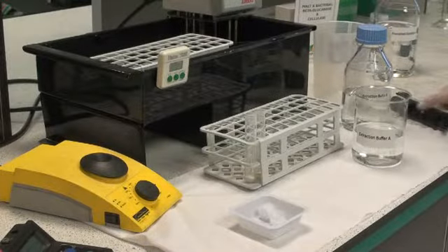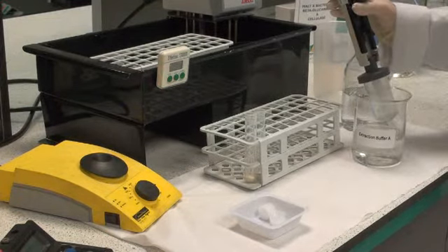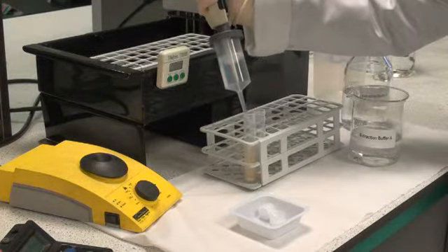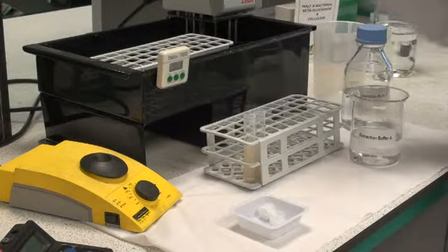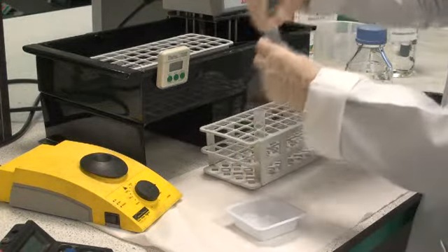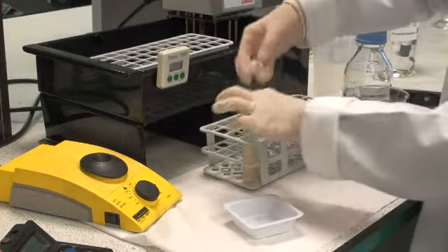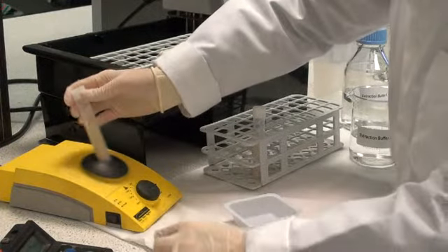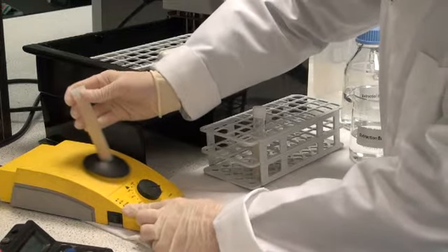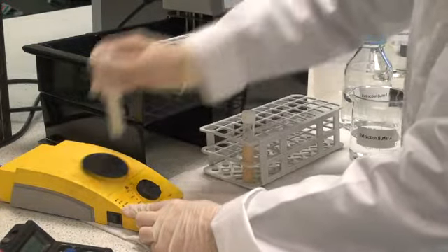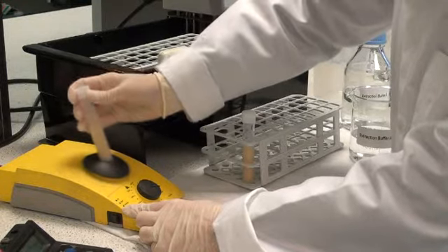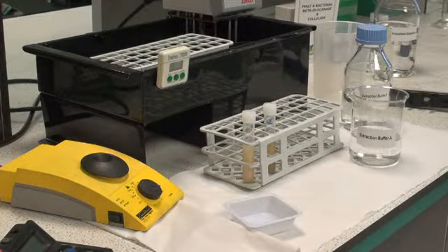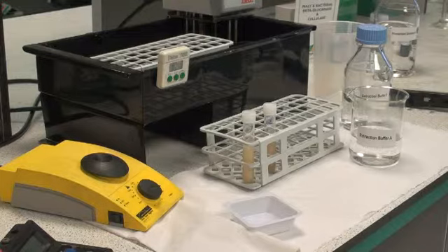Add 8 ml of extraction buffer solution A to each tube containing the milled malt samples. Cap these tubes and stir the contents vigorously on a vortex mixer. Leave these samples to extract for approximately 15 minutes at room temperature with occasional mixing on the vortex mixer.